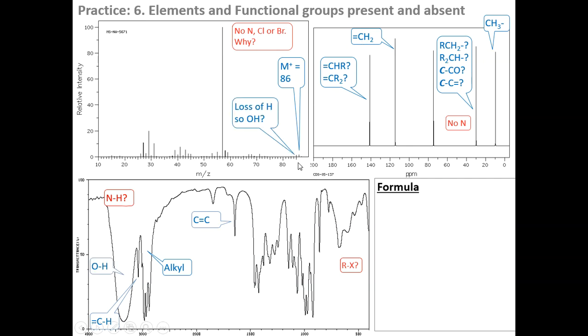Okay, we can see there is an M minus 1 peak, so that is, remember, whenever we lose a hydrogen and make a stable carbocation. So it could be something like oxygen. We do have oxygen over here, so we can link up that M minus 1 peak to the OH parabola over here. And we can say, well, this peak over here supports the evidence that I have a carbon that is bonded to an oxygen. So it supports my alcohol.